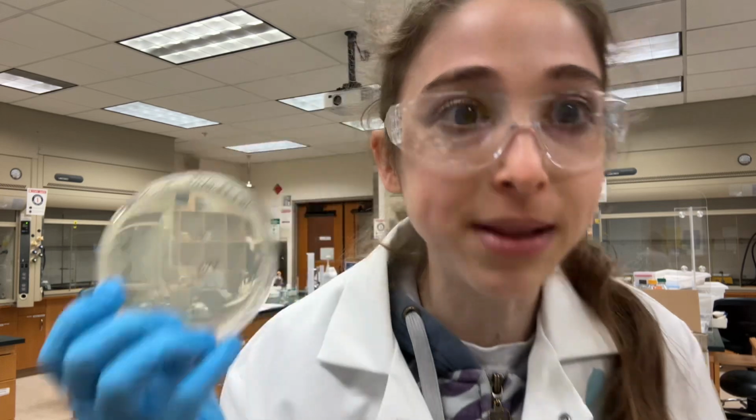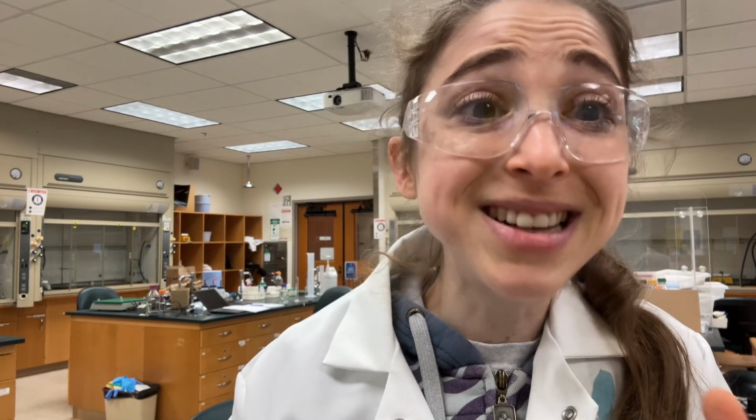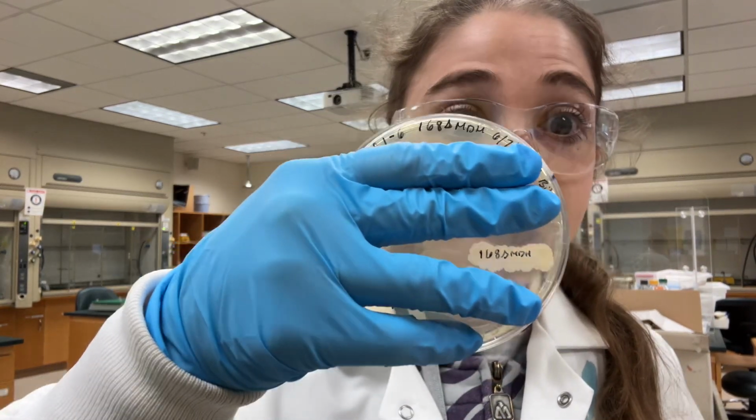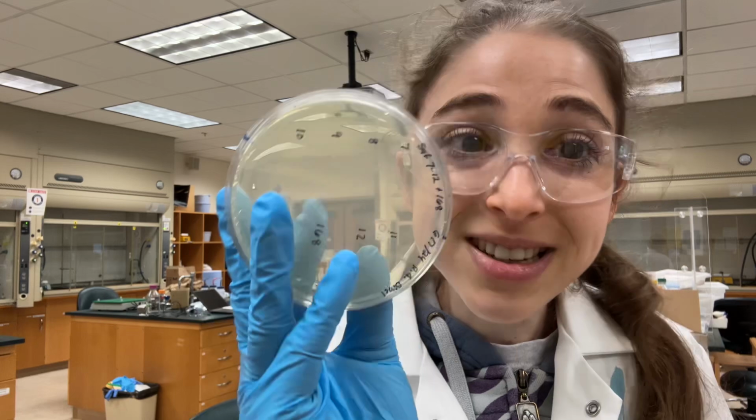Since we've got a bunch of different strains, we want to see, okay, well, are these resistant to kanamycin? One of the ways that we tested is just by plating them on plates that have kanamycin in them. And no, don't worry, these plates aren't just screwed up. We have our positive control, where we have the subtilis bacteria that has the MDH knocked out and kanamycin put in its place. And you can see here, it's able to grow in the presence of kanamycin, whereas all these other strains of our subtilis are not.